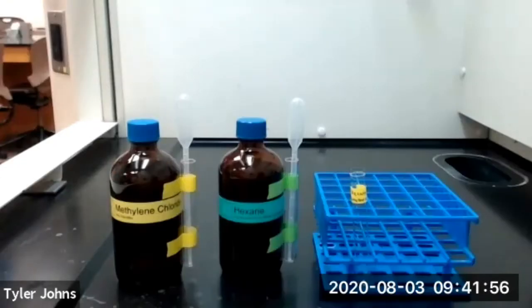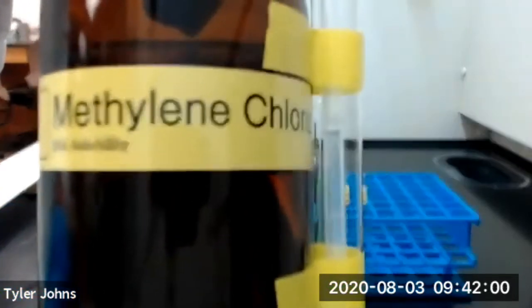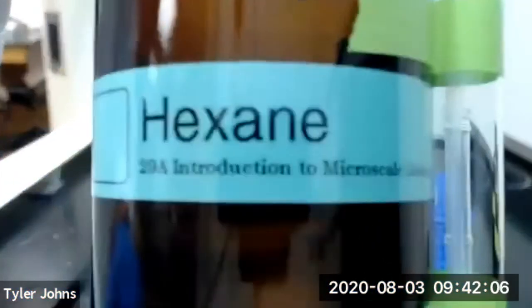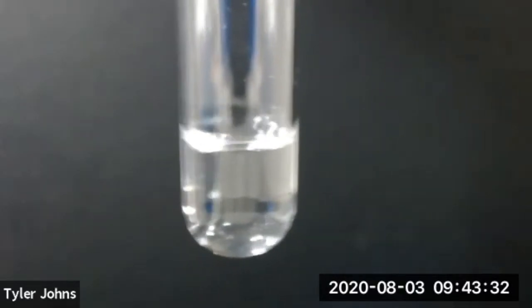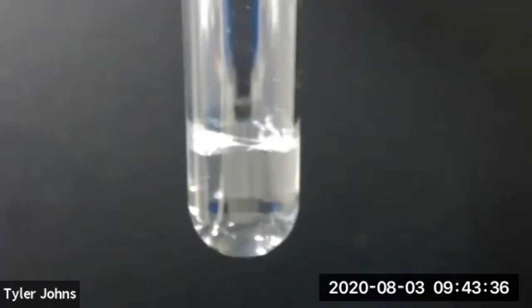The last pair of liquids that we will look at is methylene chloride and hexane. I've already added 1 milliliter of methylene chloride. We'll now add 1 milliliter of hexane.